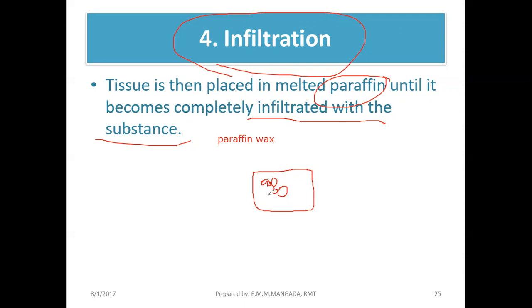Again, the purpose of your infiltration and impregnation is to make the tissue firm. That is to infiltrate the spaces with your paraffin wax. The most commonly used medium for infiltration or impregnation is your paraffin wax.